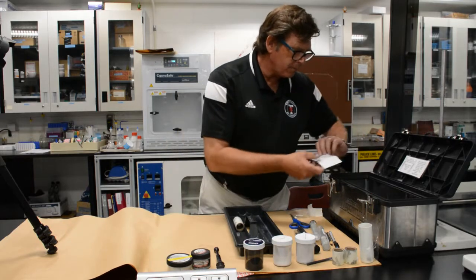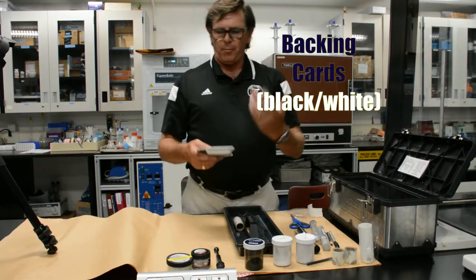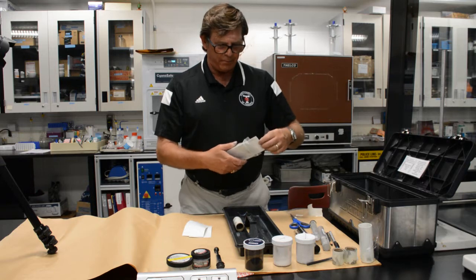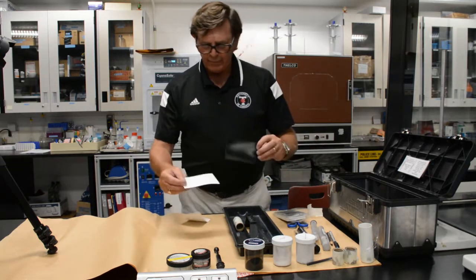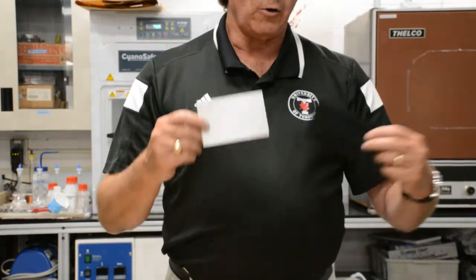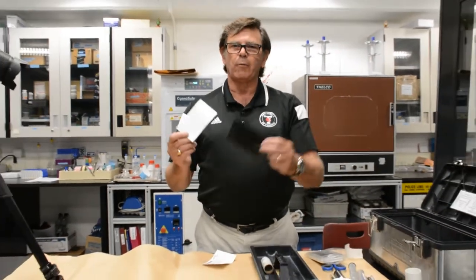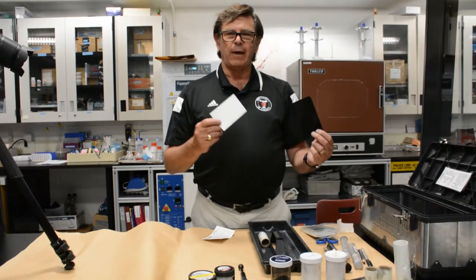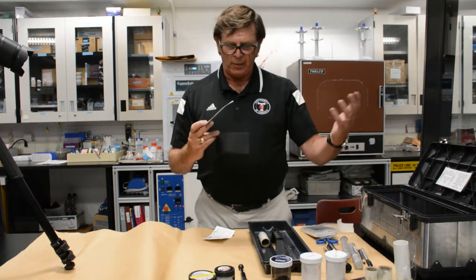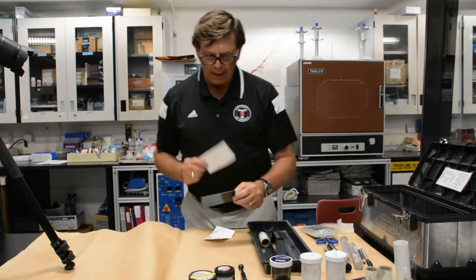Now, the black backing cards that we use are commercially made ones. We have clear acetate sheets that are available as well, but for our purposes, we will be using the black and the white cards. They would be in an envelope within your kit, and they simply give you that contrast. As we were saying, when you're using the fingerprint powder for contrast purposes, in the event you're processing a dark colored surface, you're using a light colored powder in order to see that fingerprint. Once you secure it, you need that lifted fingerprint to be on a contrasting backing card. So again, a dark surface, a light powder, the light powder would go on the dark backing card, and vice versa on the white card if you're using black powder.